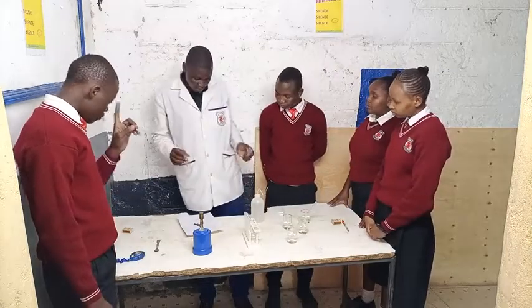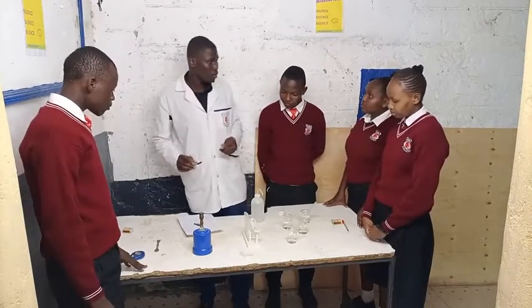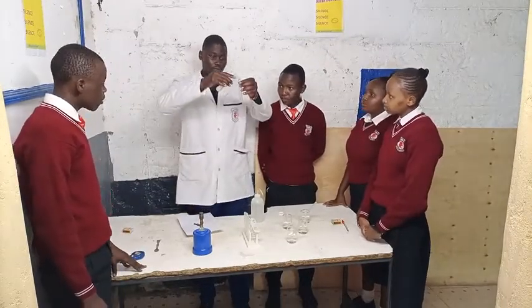Now, we are supposed to divide into how many portions? 1, 2, 3, 4. Four portions.